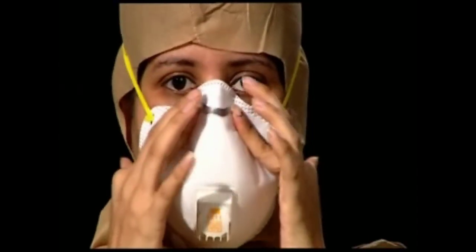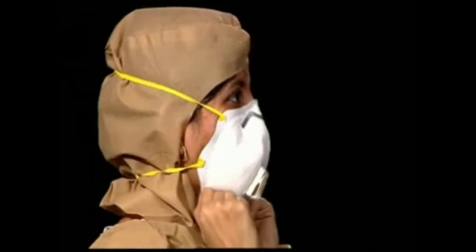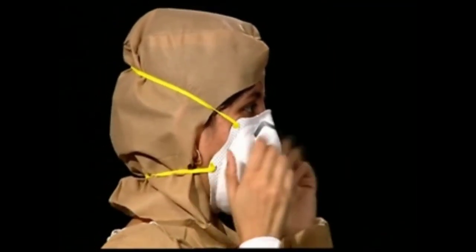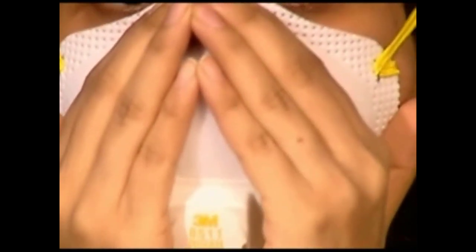To ensure the mask is fit properly, conduct a fit test by blowing air into the mask. If the air leaks around the nose or at the edges of the respirator, then readjust the mask. If the mask is correctly placed, air should only come out from the front portion of the mask.